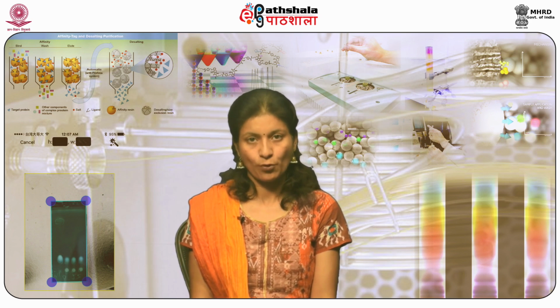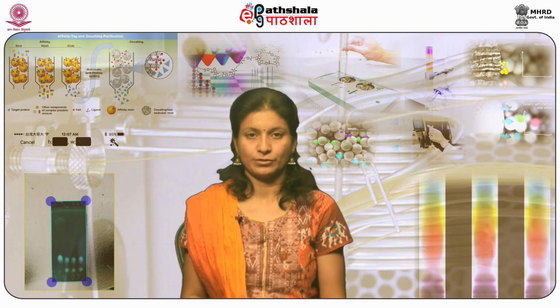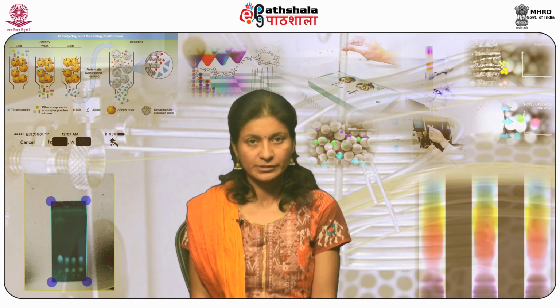The injection port is maintained at a higher temperature than the boiling point of the least volatile component in the sample mixture. A separation column, that is the stationary phase, an oven and a detector.